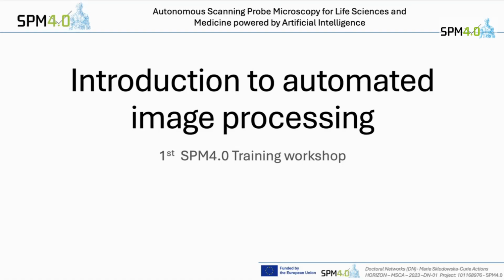Right, so we'll move on to the last section of this morning. And I'm going to try and give you a bit of an introduction to automated image processing now. So I'll talk through a few slides and then we'll try and use a bit of software on this as well.